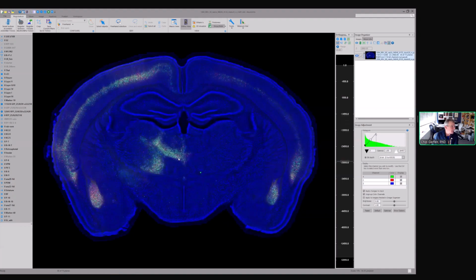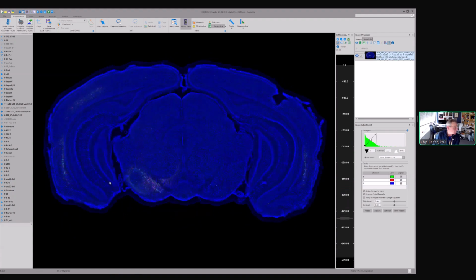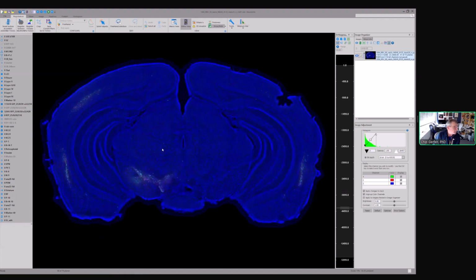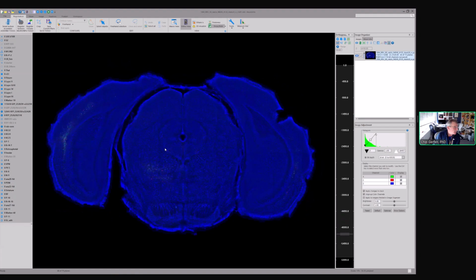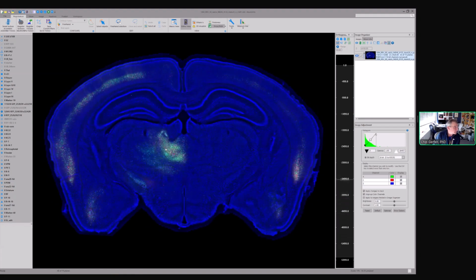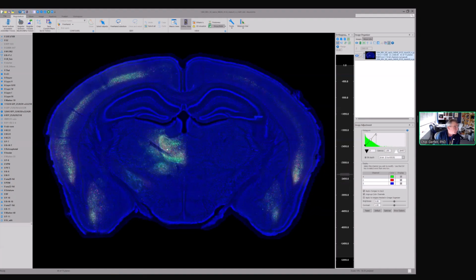There are neurons in the thalamus that project to the striatum and the amygdala. And this is the necessity of being able to do whole brain imaging: neurons in the substantia nigra, pars compacta. So this is why, to analyze this type of circuitry, it's necessary to do whole brain analysis, and we can do that using NeuroInfo. This is the first step of that. I'm going to describe how we make this 3D volume for the next step, which is registration.